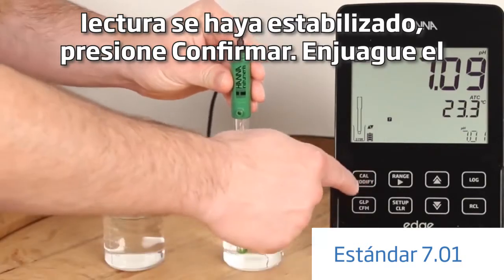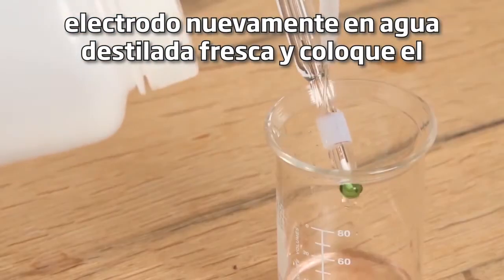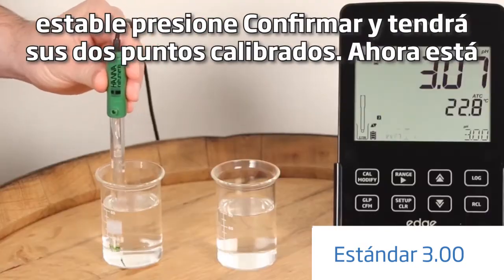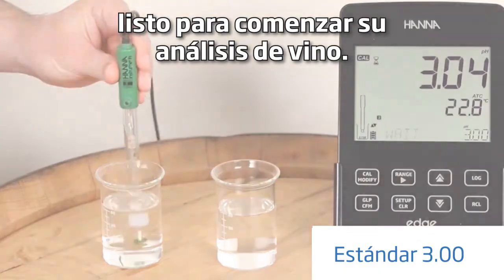Once the reading has stabilized, press confirm. Rinse the electrode again in fresh distilled water and place the electrode in your pH 3 calibration buffer. Once stable, press confirm and you have your two points calibrated. Now you're ready to begin your wine analysis.